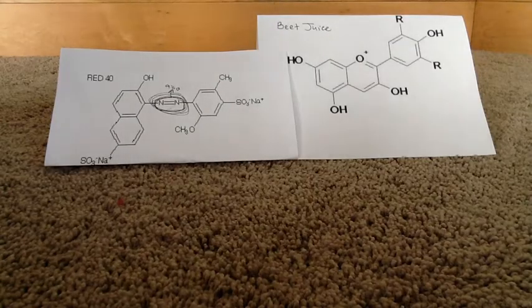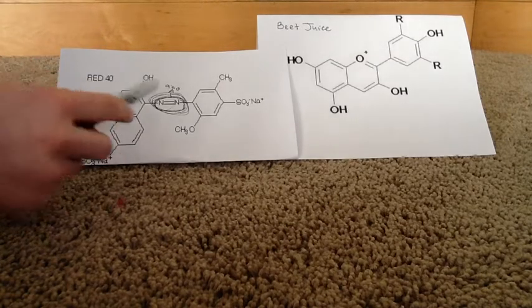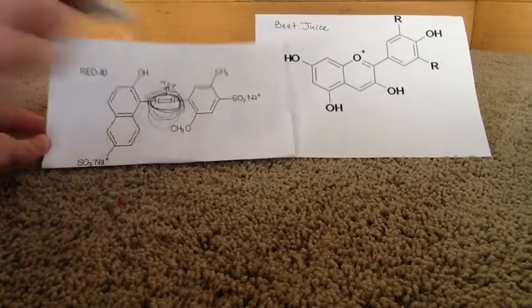As the pH varies, it is likely that the synthetic red 40 dye will reach max absorption at the lowest pH, the sample with the most hydrochloric acid added, and have a longer wavelength of max absorption than the beet juice. Their similar structures and colors would lead to expectations for similar wavelengths and absorptions as stable compounds, but the azo bond in FD&C red 40 dye likely strengthens the red color of the dye more than the natural beet juice.